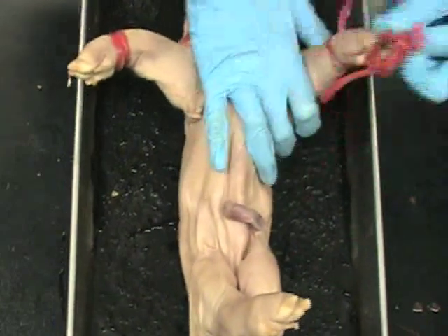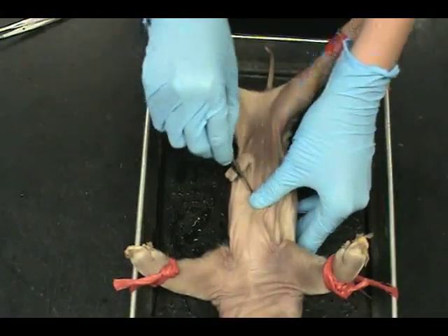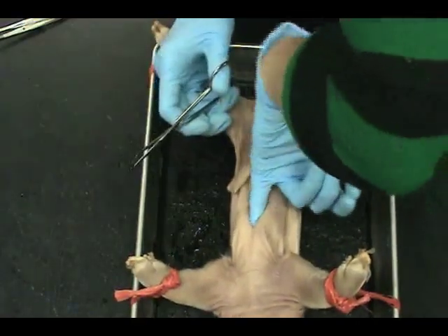Tie the twine to the pig's limbs to secure it in the tray. Make a small incision in the abdomen. Use your finger to locate the diaphragm.